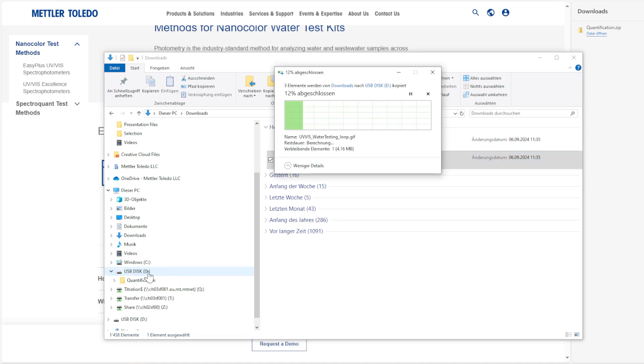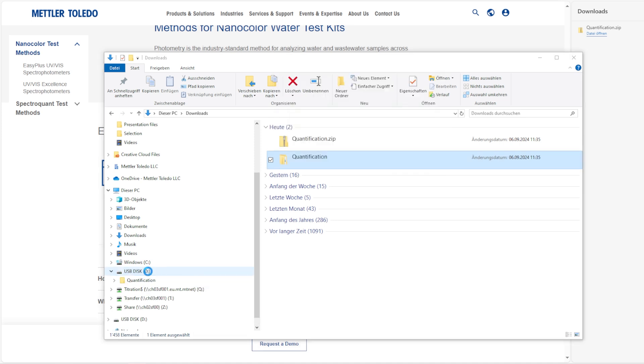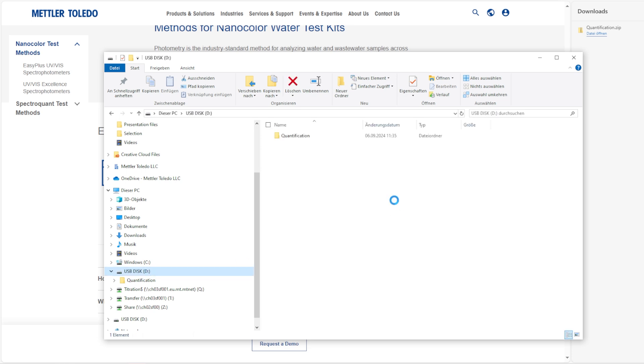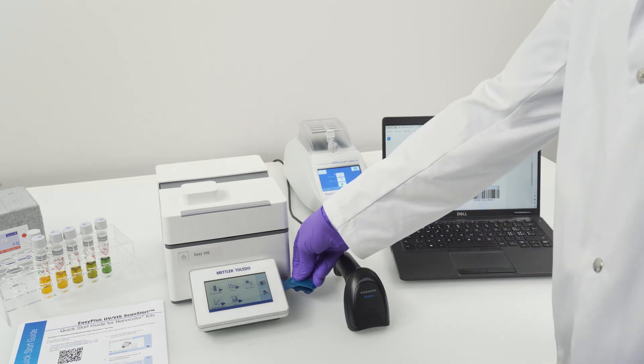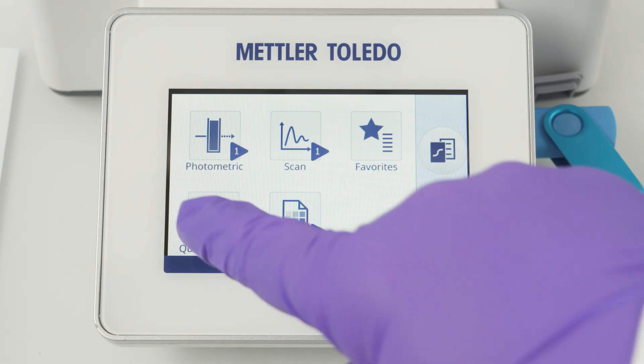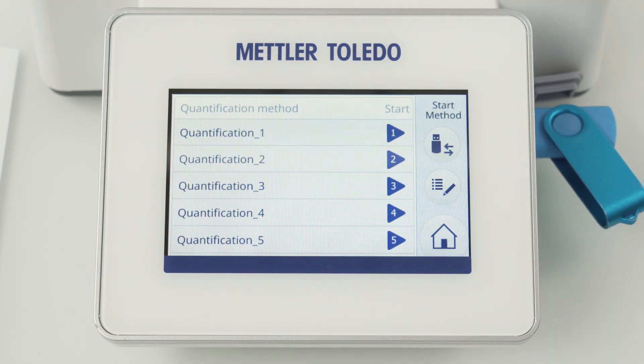All methods for Nanocolor test kits are quantification methods. Therefore you can import your desired methods into the quantification category. To do so, connect the flash drive to the instrument and navigate to the method list, where you will find an import/export button.